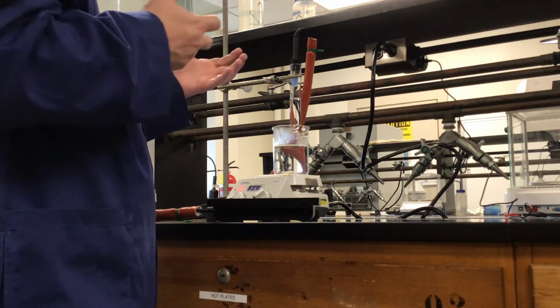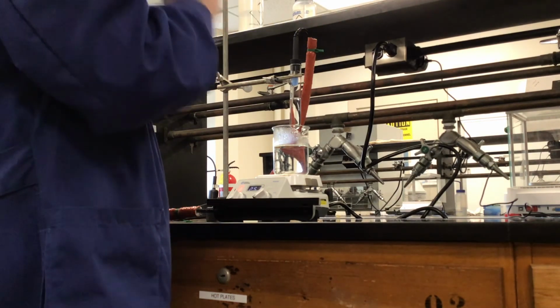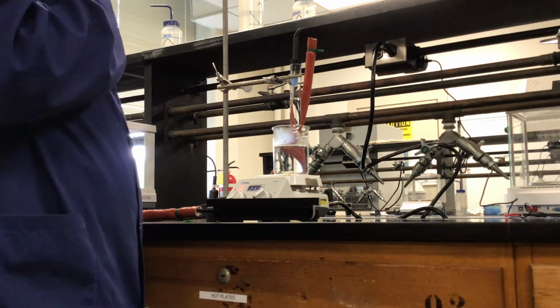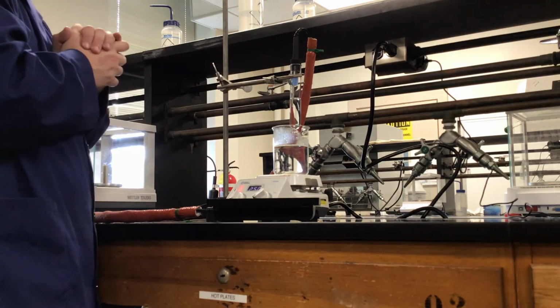And then as it gets close to the boiling point, you'll see it start to slow and then level out and plateau. What we're interested in is what temperature that plateau is at. That's what we're going to use for the actual boiling point measurements that we'll then put into the calculations that we described before. But that's the main bulk of the experimental setup pieces that we're really worried about.